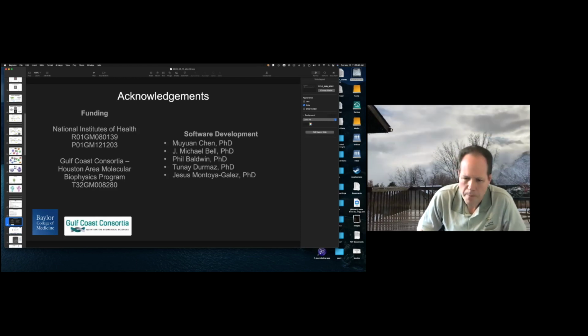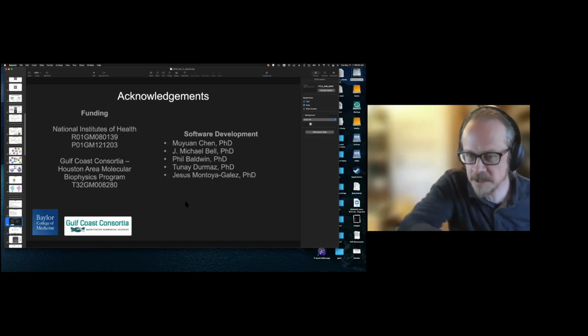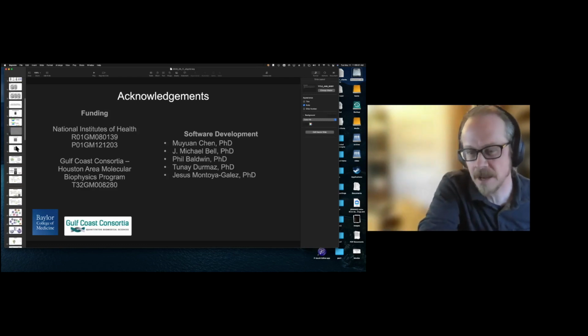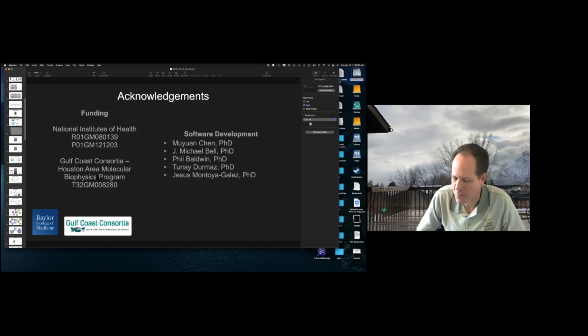Okay. Yep. Got a question here. It's kind of a long one. Is the GMM for SPT coming with EMAN3? Estimate release date for EMAN3? If I give an estimate for EMAN3, it'll probably be about as accurate as it was for the 2.9 release, which was delayed like 9 months from when I thought we were going to do it. We try to do 1.5 releases a year normally. EMAN3 may be a pretty major overhaul, so I'm guessing realistically probably sort of the end of the year, early next year, something like that.